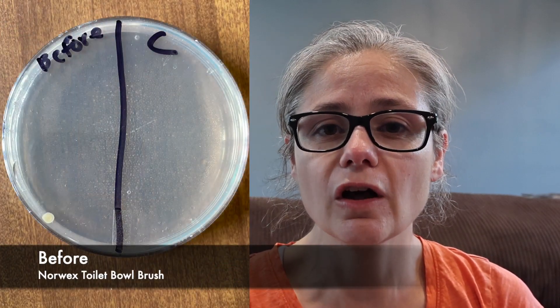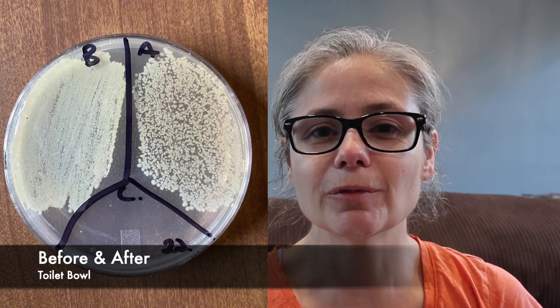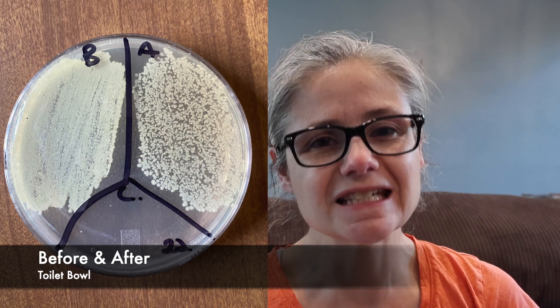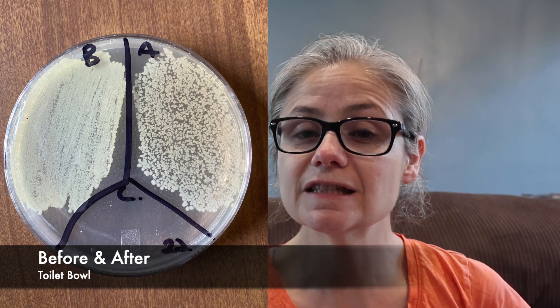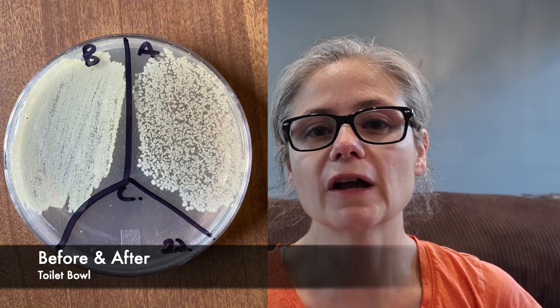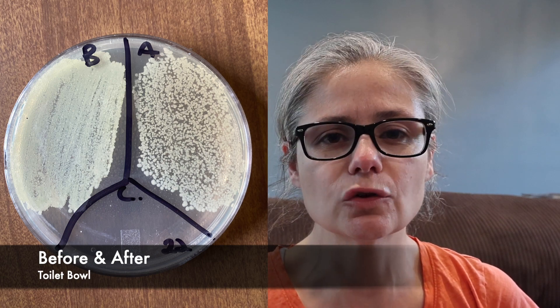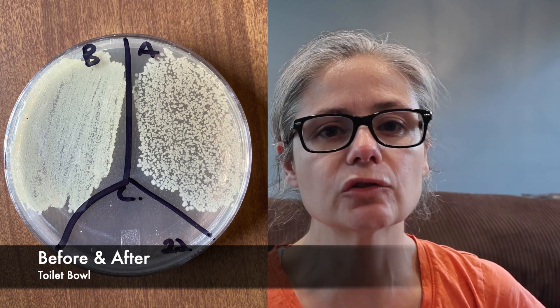Now for some results. Let's start by looking at the bacteria on the toilet brush before any cleaning — there's just one bacterial colony on the brush before we get started, so that's fantastic. Next, let's look at the toilet bowl results before and after cleaning. In the before section we can see a lot of bacteria, which we expect from a toilet bowl. In the after section there's still a lot of bacteria — we can see a visible decrease, but there's still a tremendous amount. The Norwex bathroom cleaner and toilet brush did not do a fantastic job at removing bacteria, but remember, they never claimed to be able to remove bacteria.